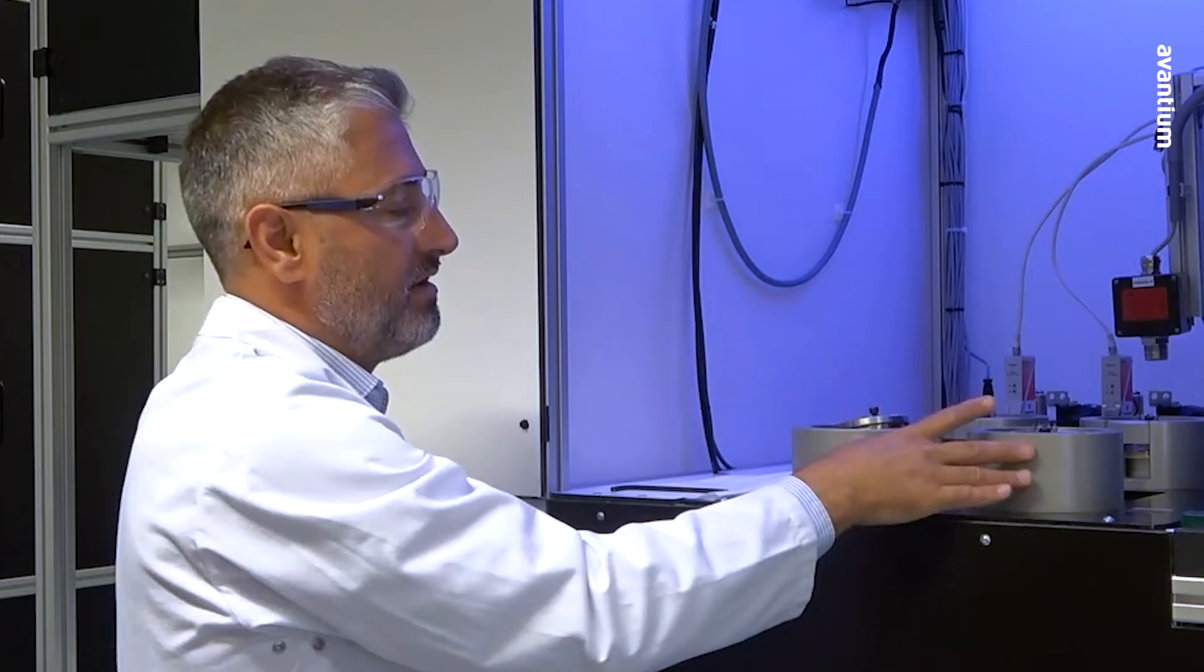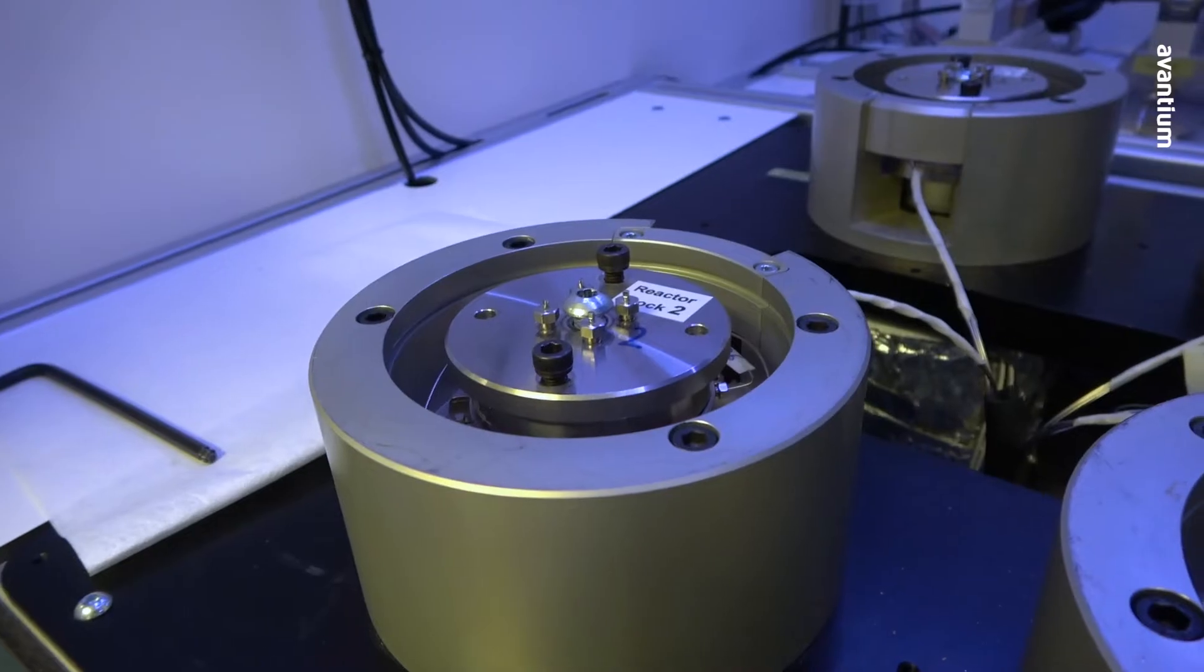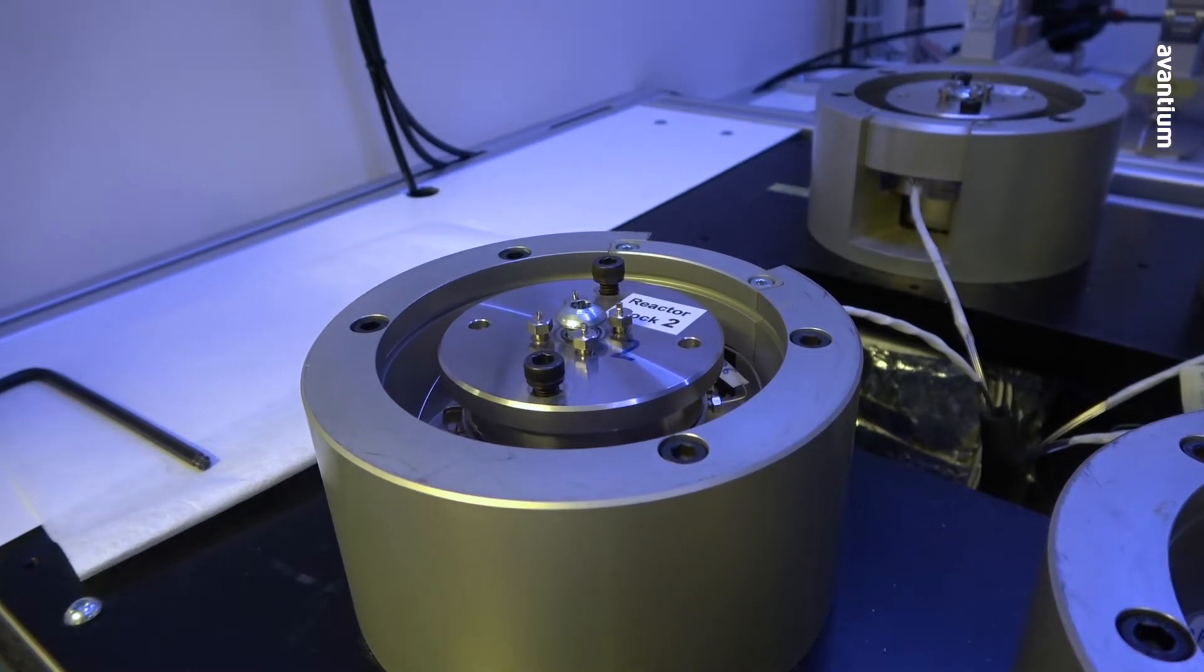So as I said in the beginning, four blocks, each block has four reactors. So in total, 16 reactors in parallel.